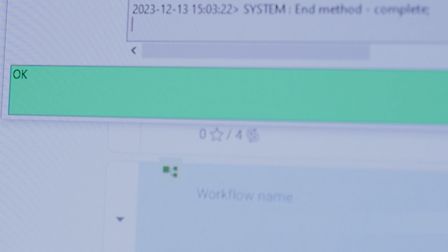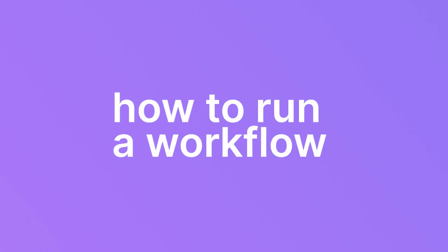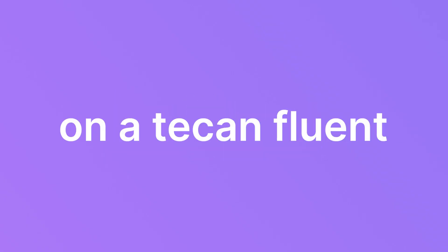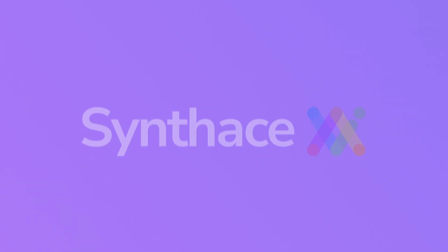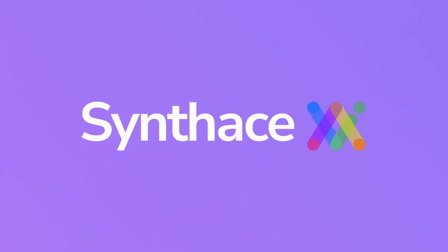Once the run is finished the device plugin on the computer will say method complete. And that's how to run a workflow on a Tecan Fluent using Synthace.